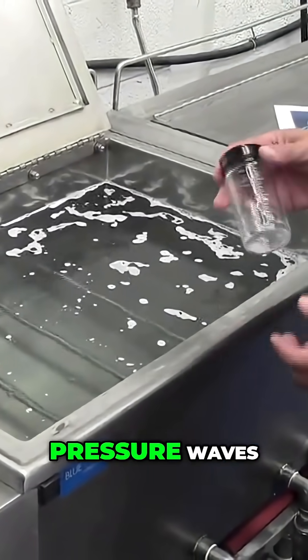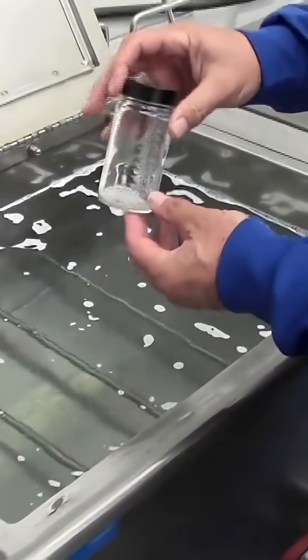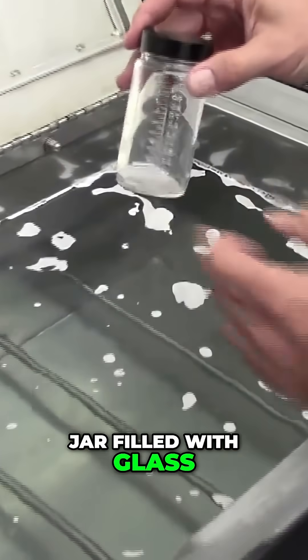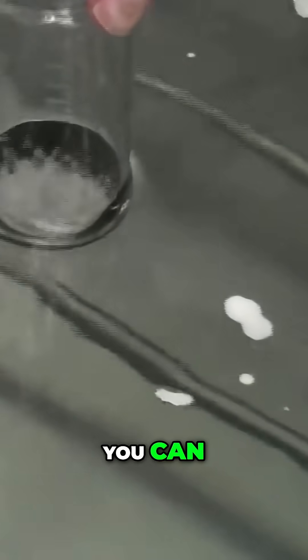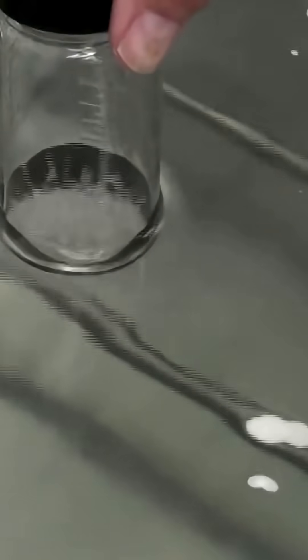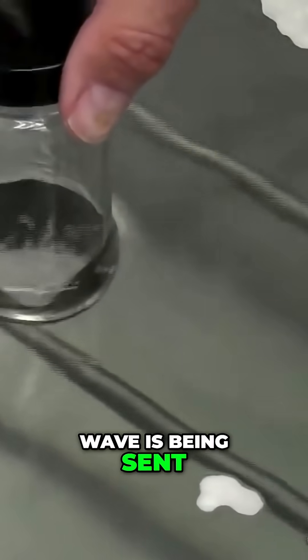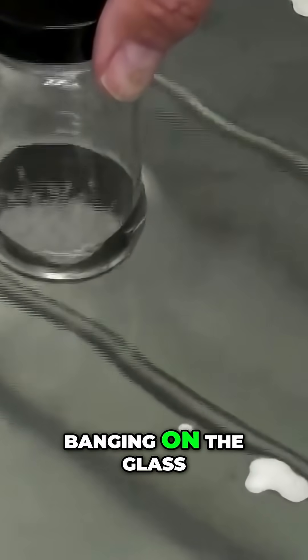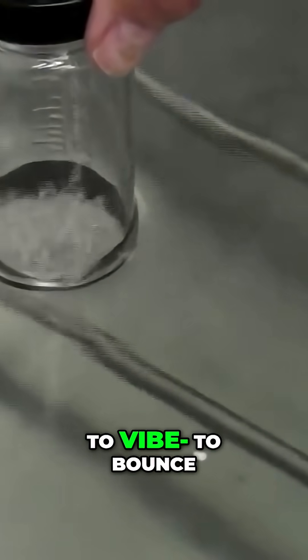You can't see those pressure waves. But if I take this glass jar filled with glass beads and place it in the ultrasonic tank, you can see the glass beads just bouncing. The reason that occurs is because the pressure wave is being sent through the solution, banging on the bottom of the glass jar and causing those beads to bounce.